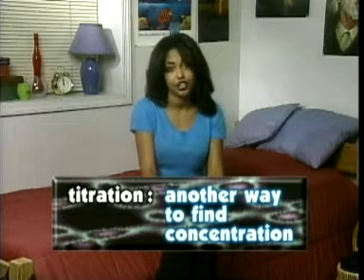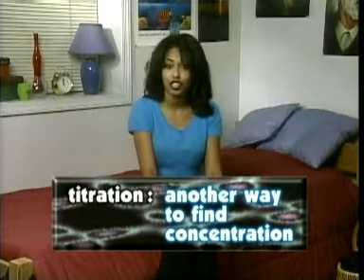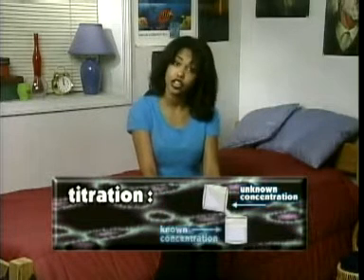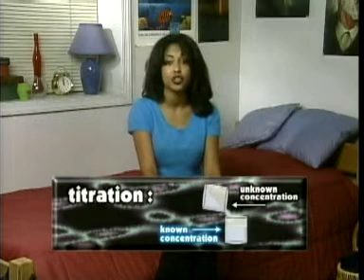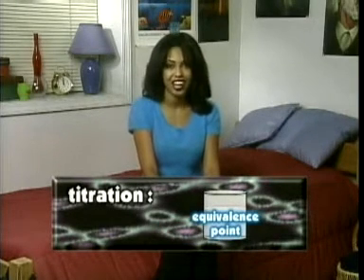Where are we leading with all this acid-base stuff? Titrations! No, that's not a titration. A titration is yet another way to determine the concentration of a solution. All you have to do to find a concentration with a titration is add an unknown concentration to a known concentration until the mixture reaches the equivalence point. Then do an easy calculation and you have the concentration.